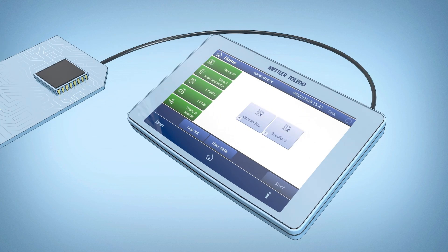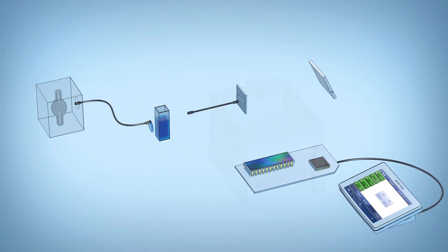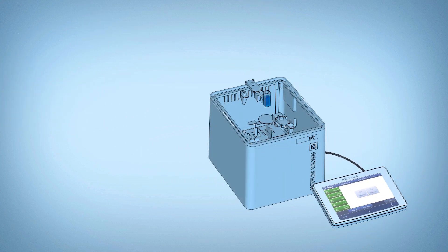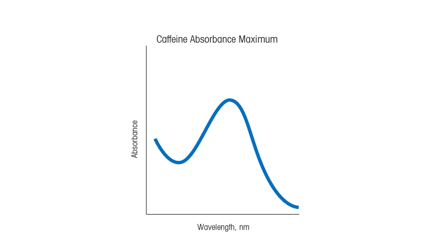This setup allows us to measure and view the spectrograph on the instrument terminal in only two seconds. The spectrograph shows the absorbance values of that sample for the whole range of wavelengths within the ultraviolet and visible regions.